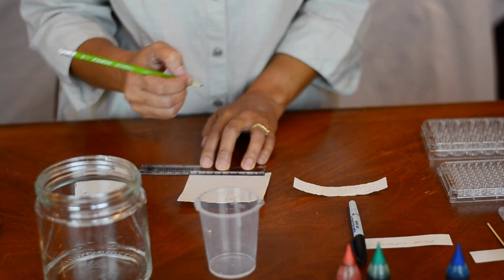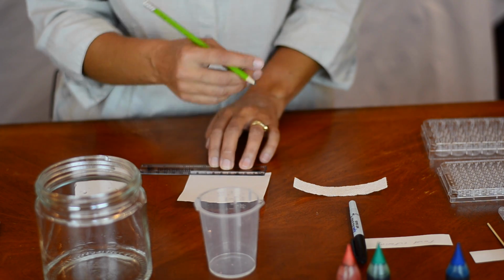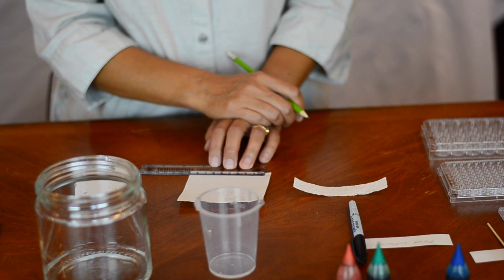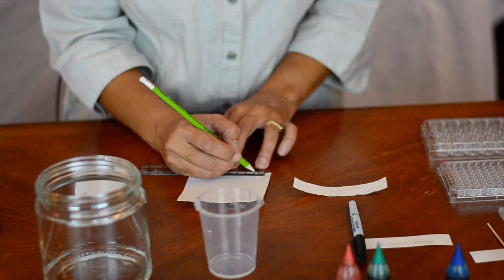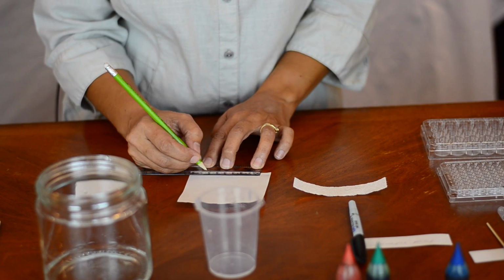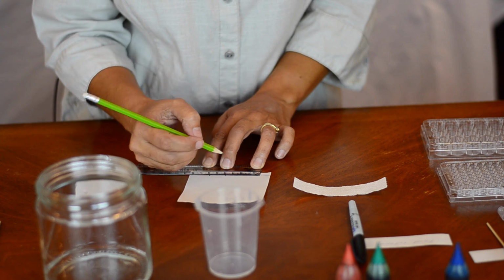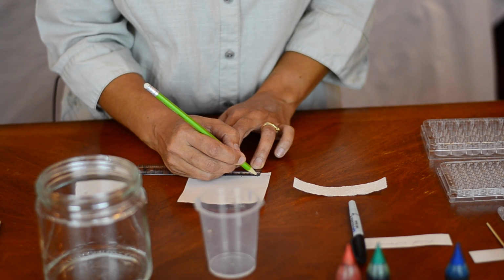You don't want to have any impurities in your water that will affect the experiment. And we're going to make some markings on that line that's 1 centimeter from the bottom of the paper. I'm going to have three different samples, so I'm going to make 3 marks, and they're going to be about 2 centimeters apart. So I just picked about a 6 centimeter piece of this line in the center, and I'm marking markings 2 centimeters apart. I'm going to make 4 markings actually, because I want one that I'm going to consider a control, which will just be where my pencil mark is, in case for any reason my pencil manufacturer has lied to me and there's more than graphite in this pencil lead.